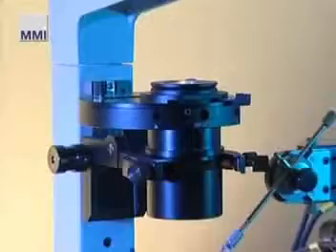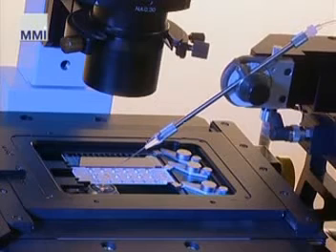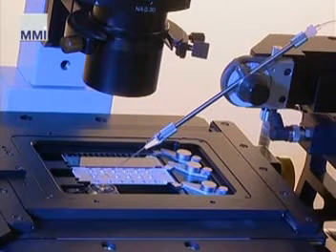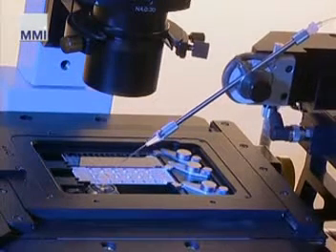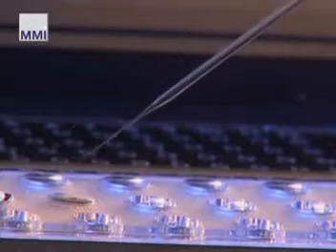It facilitates the automated isolation of any type of single and rare cells in three steps: cell recognition, cell aspiration, and cell deposition.